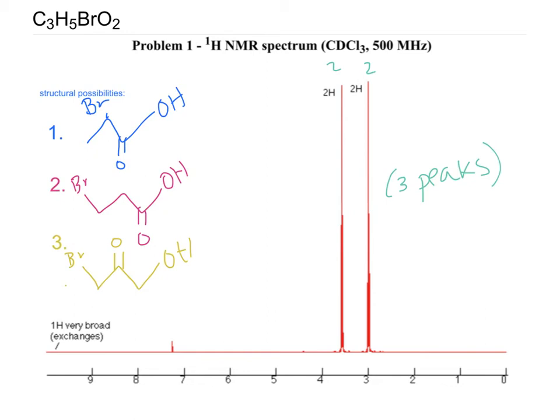Ultimately, this splitting and the ability to find the area under the curve to find the grouping of the hydrogens is very, very useful. Also, you can notice in all the 3 structures, I try to incorporate all the clues that we figured out from the previous MS and IR graphs. So I've included alcohol groups and ketone groups in all of them. However, right off the bat, you can tell that the first one already does not have enough hydrogen, and also the grouping is off, as this group right here would be 3 protons. So this is not correct.